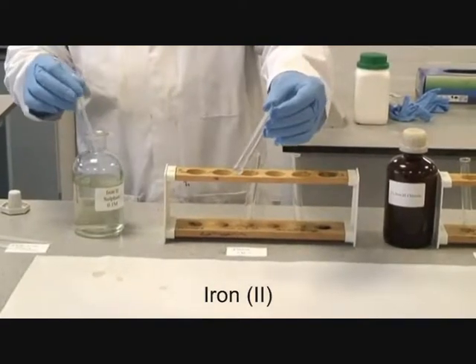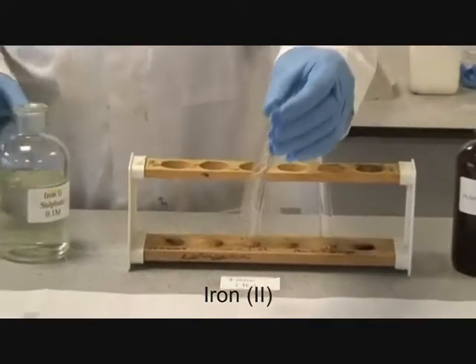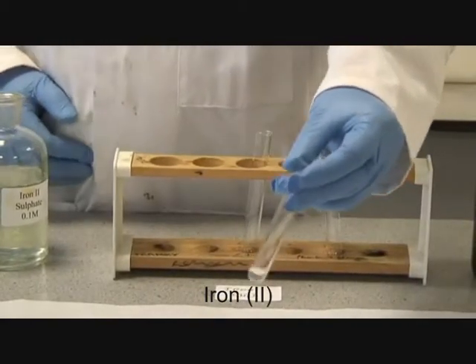That is your iron 2. It is difficult to see, but that is actually a very pale yellow colour.